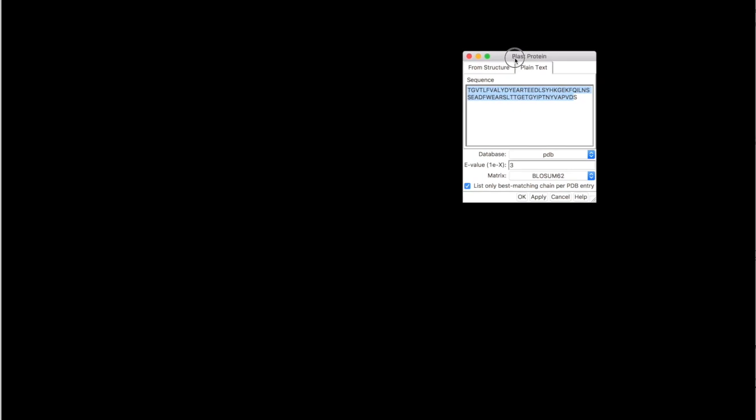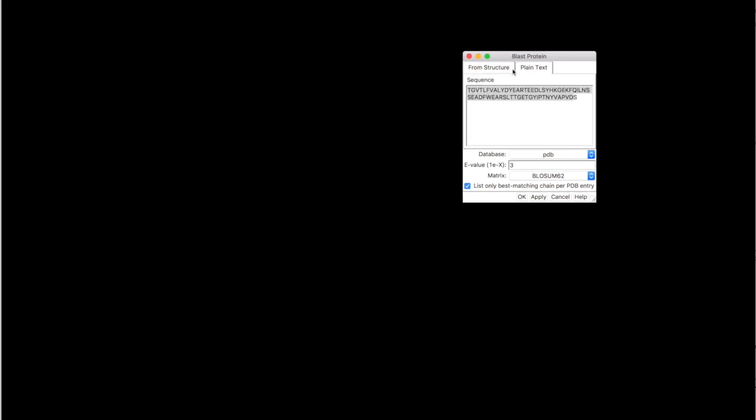Now the new dialog opens and you can select from Structure or Plain Text. Since we are going to work from scratch, we are going to use the Plain Text option.